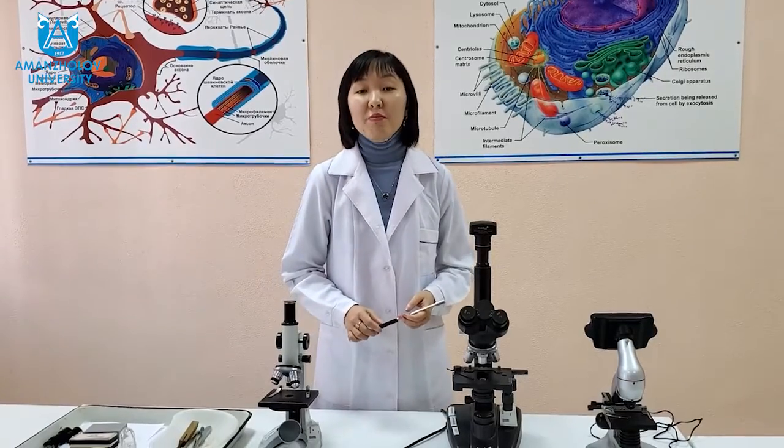Today, it is difficult to imagine scientific activity without a microscope. Microscope is one of the main structural research methods in biology and biotechnology. The name microscope comes from the ancient Greek words. Micro means small and scopere means look. A microscope is a sophisticated magnifying device with multiple lenses. Microscopes give a magnification of 100 or even 1,000 times.